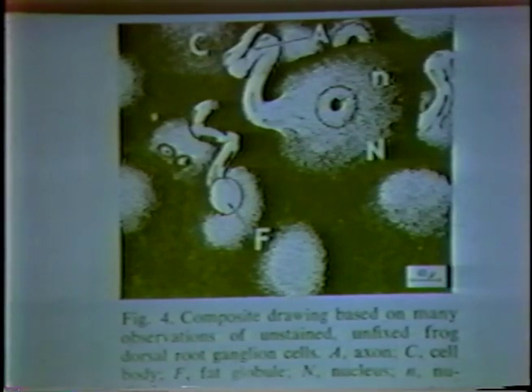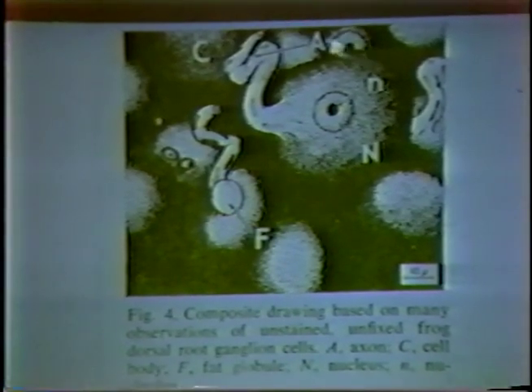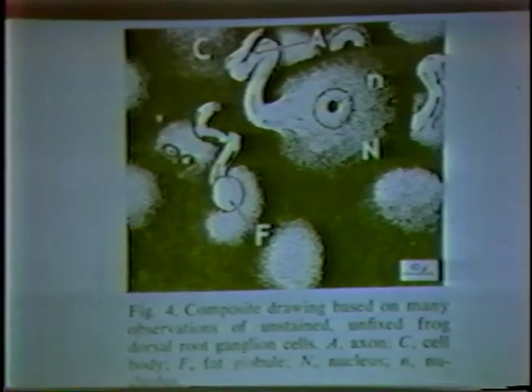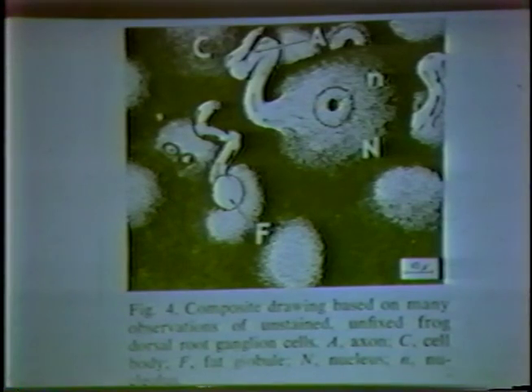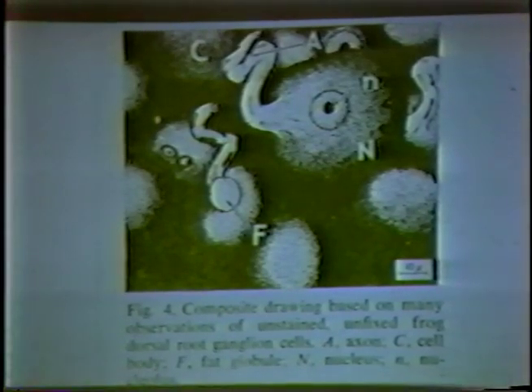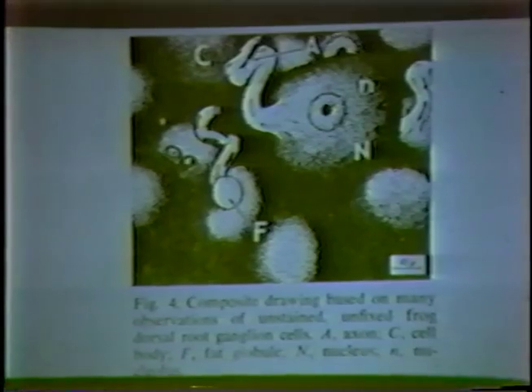But it was also because in their initial paper describing the results of this microscope, published in Science in 1967, 21 years ago, they only illustrated it with drawings because they found it hard to convey the excitement of being able to get information from individual focal planes and put all this information back together. So what they did was to make composite drawings from focusing down through their live specimen.